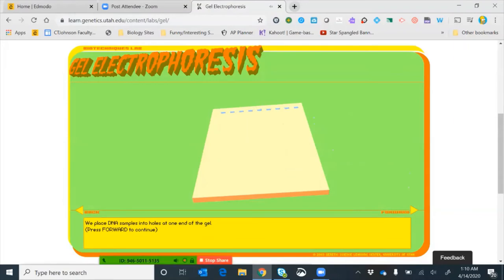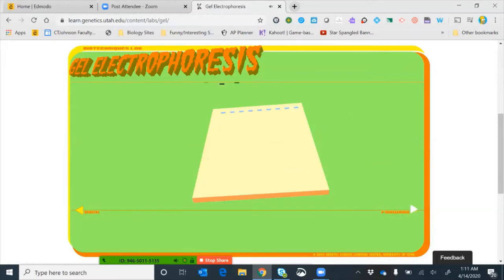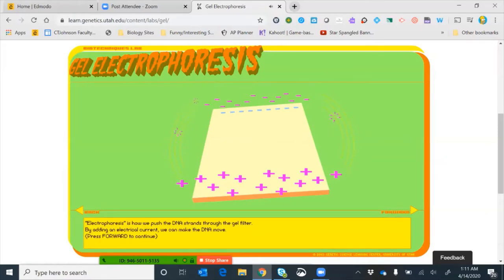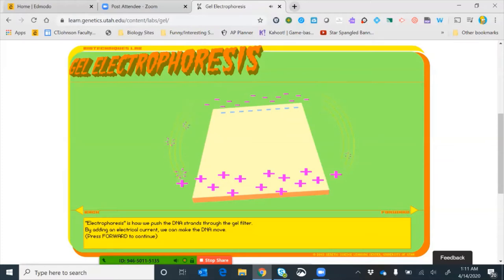We place the DNA samples into holes at one end of the gel called wells, using a micropipetter to load the DNA samples in. The wells are at one end because the DNA will travel toward the other end. Electrophoresis pushes the DNA strands through the gel filter by adding an electrical current. DNA is negatively charged, so it's attracted to the positive end and repelled by the negative end, pushing the DNA through the gel.